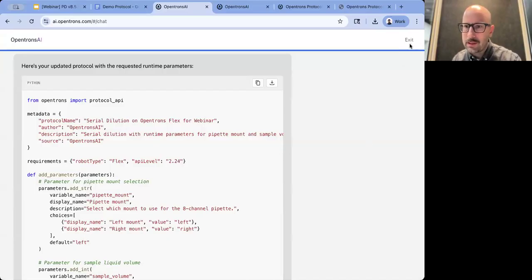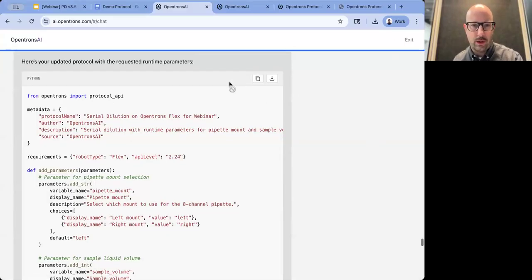And then regarding UX, could we click a step and then have the edit step panel pop up automatically instead of having to right click and click edit every time, since I don't really have a reason to just left click? Yeah, that's great feedback. I'll log that one, John.